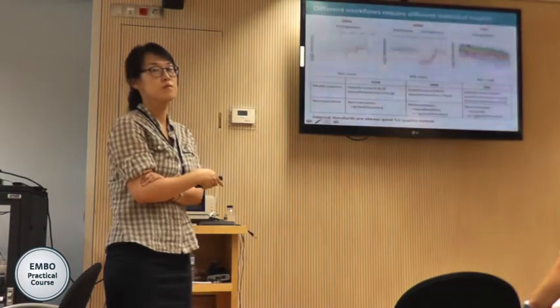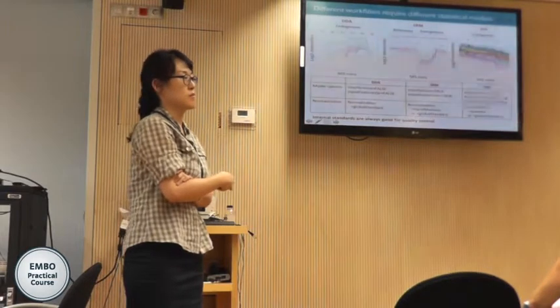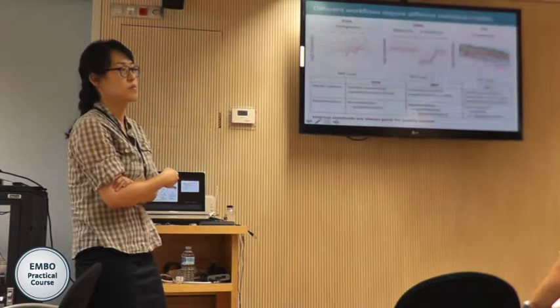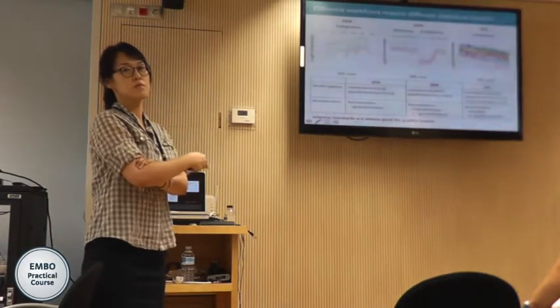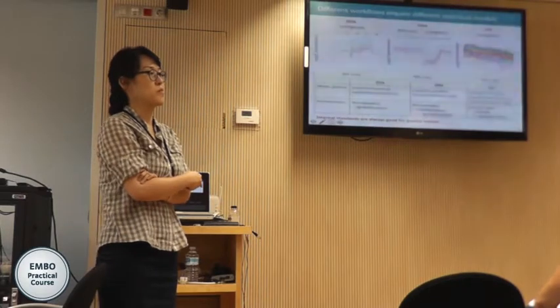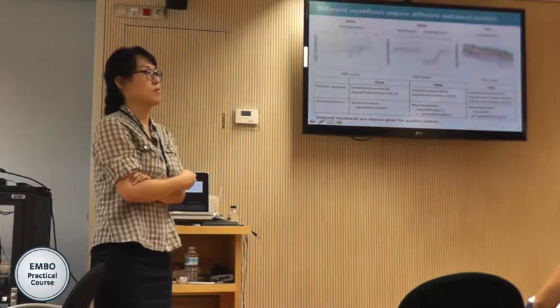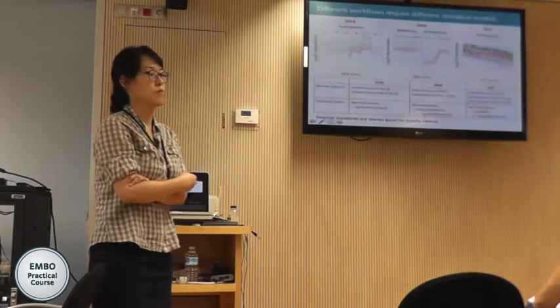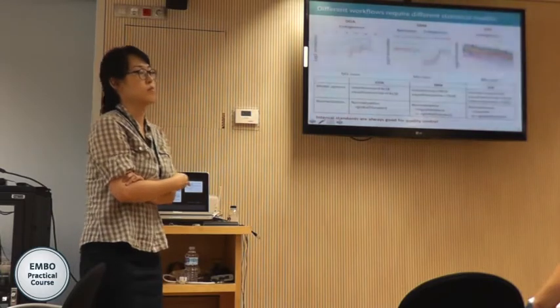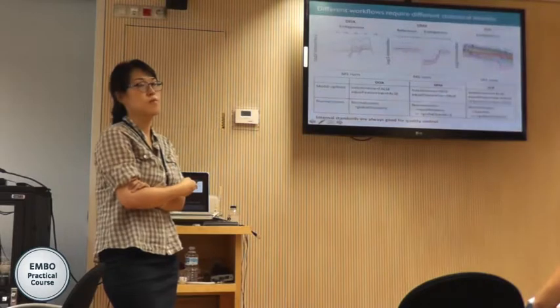And it's true in SRM often because the experiments are well calibrated, and you know what you're looking at. In DIA, there are a lot of stochastic, random events happening, and also some uncertainty in how they are interpreted computationally. So these interferences are still present, but we treat them as part of the random variation as opposed to systematic. So when you say interference equals false, you actually have larger noise in the system, so it will be more difficult to detect changes.